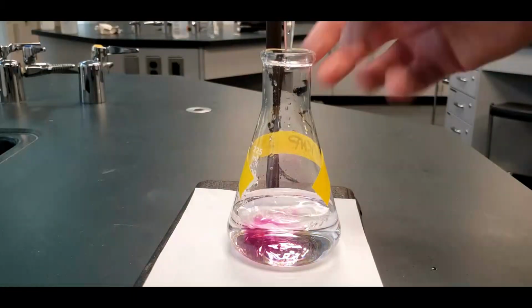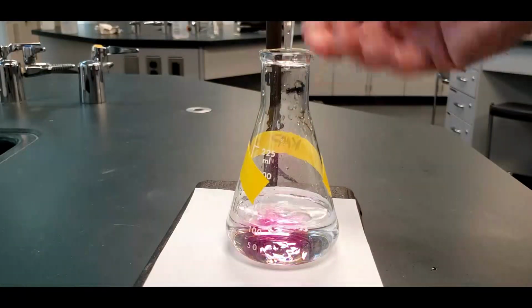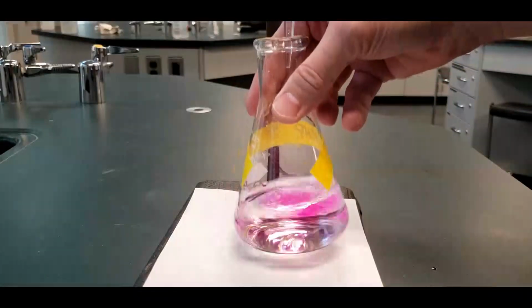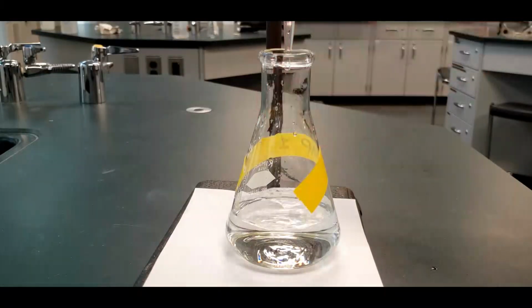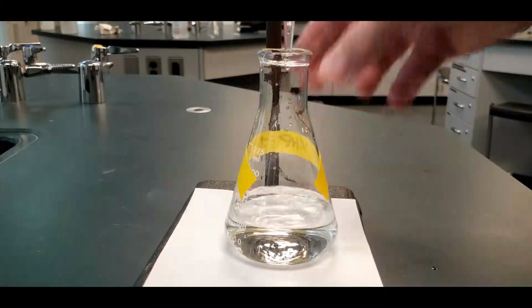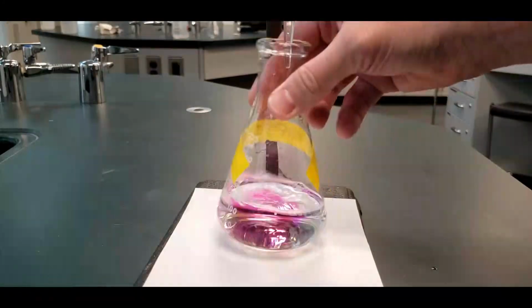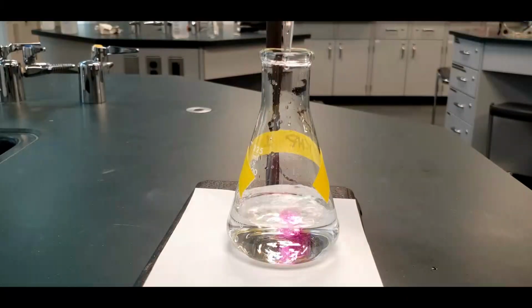Okay, you can see just adding a tiny bit of the sodium hydroxide, and the color stays for a long time. Don't want to overdo it here. If you do, a lot of times it looks really bad. It's almost fluorescent, but really you've only overshot it by maybe even a few drops. That's all it would take. But we want to get this one really as close to the true end point as possible.